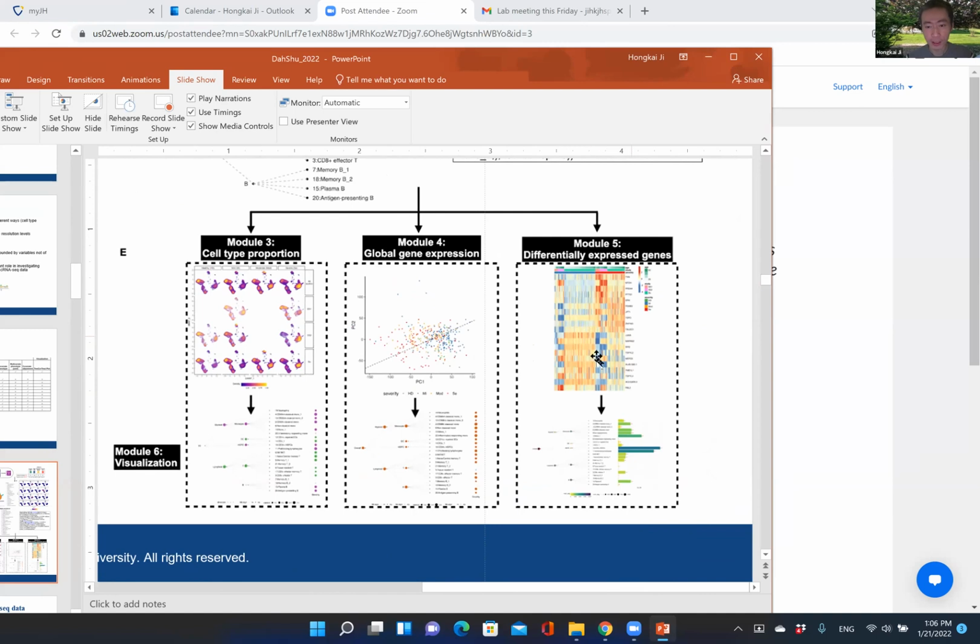So for the differential gene expression analysis, you can still do it with only 2 or 3 patients per group. That was done traditionally in limma and in, say, DESeq2 or other bulk RNA-seq analysis. So you can still do it here, right?